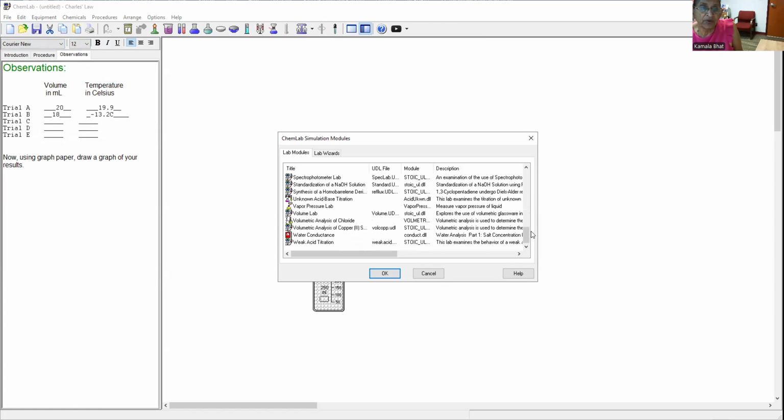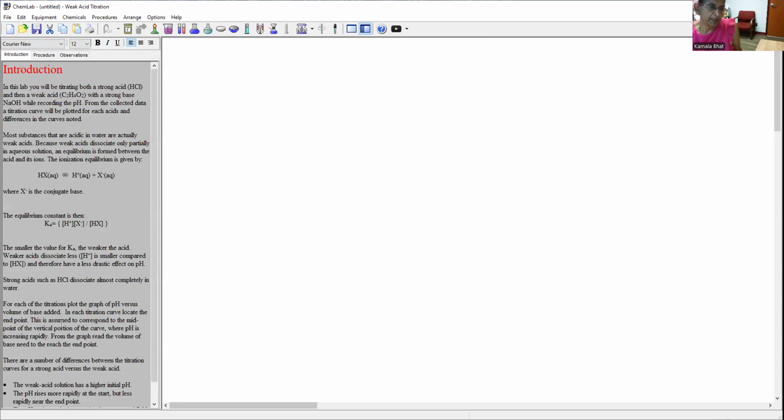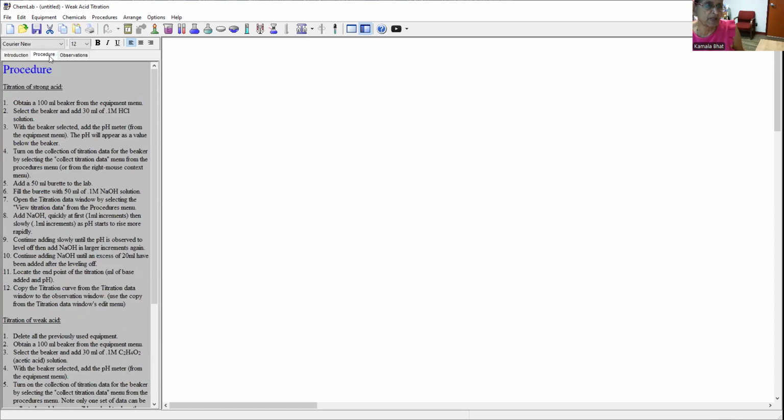And please note, I'm not going to take the exact volume as required in the titration, but you can check out, read the introduction, write it in your own words, and make sure that you do not copy it. I do not want to be responsible for any plagiarism. All lab reports submitted go through the global search, indicating that I am looking for originality in words. And so too with the procedure, write it in your own words. Don't copy the steps as such.